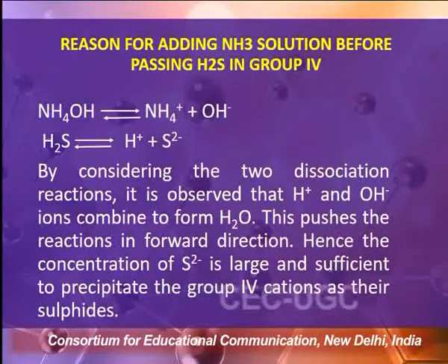Now for the precipitation of group 4 cations, we have first added ammonia solution in excess and then H2S has been passed.